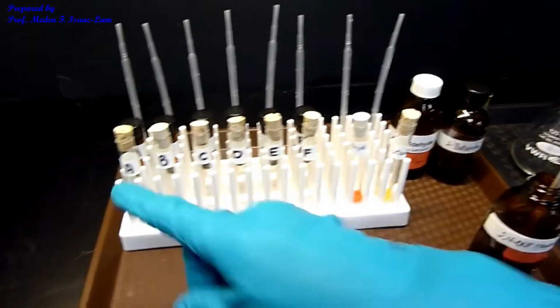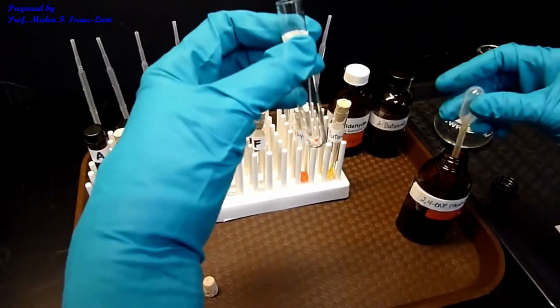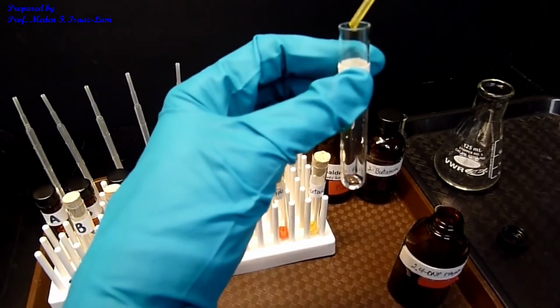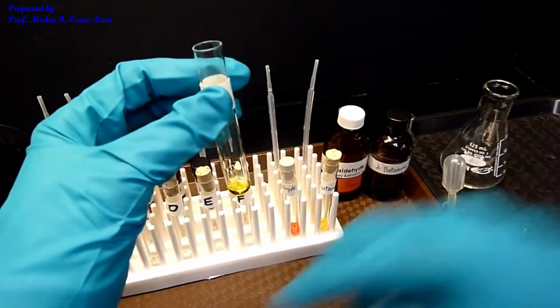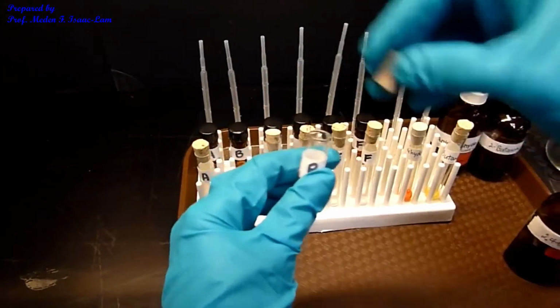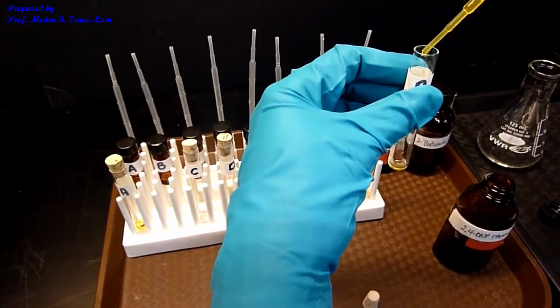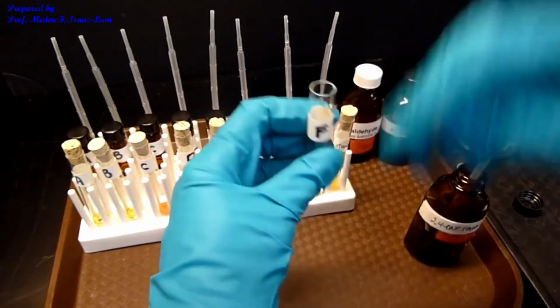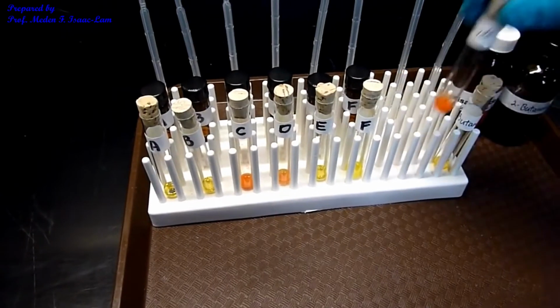And then we're going to do A, B, C, D, E, F for the unknowns. I'm just going to add the reagent and then we'll observe. And then the last one, F. So let's review the results.